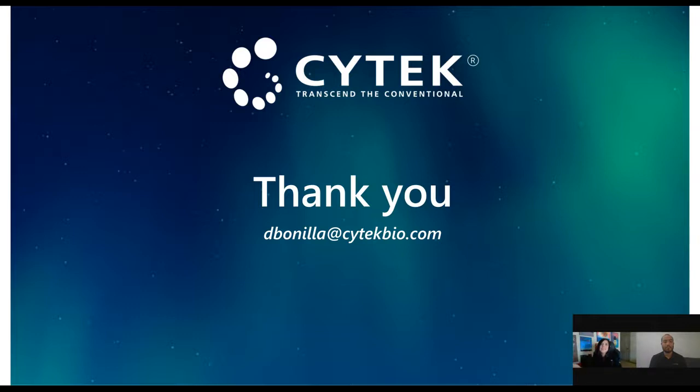I would do it at least the first time, if it's a longitudinal study, with all your samples, so you understand better your system, your particular tissue, your particular conditions, and if it's a tumor, your infiltrate or the actual stromal cells. But yeah, it's a critical point: having very few events makes it difficult to understand the signature, and then makes it difficult to do the extraction in a representative population of what you will have in that multicolor sample with more and more events.